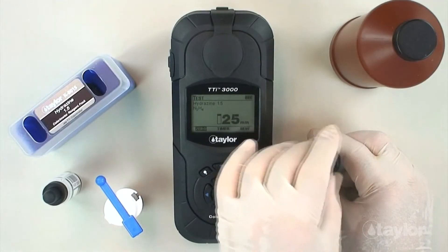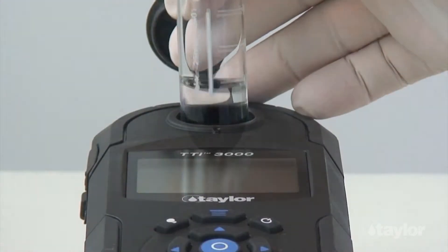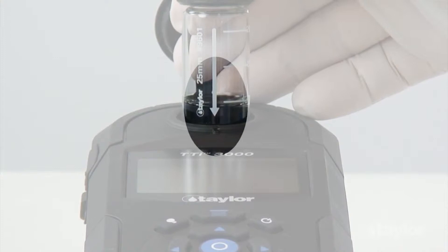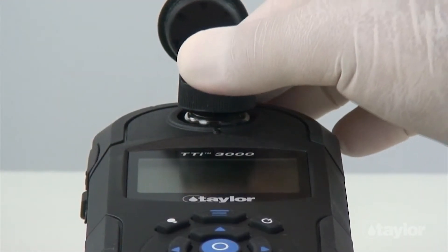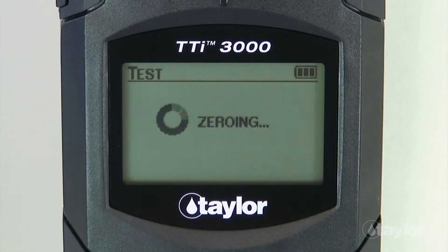Insert the sample cell into the sample cell compartment, aligning the arrow on the cell with the notch on the sample cell compartment, then gently push down. Select 0 using the scroll arrows, then press Enter. 0 will be displayed on the screen.